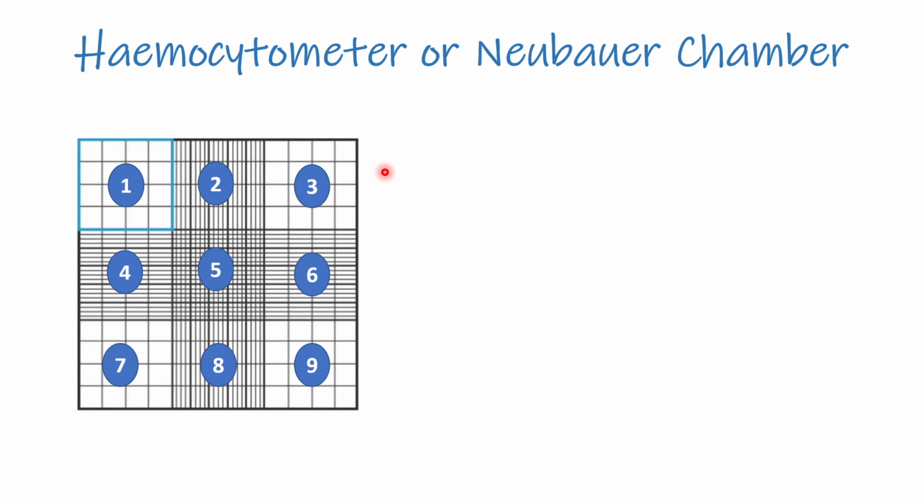Now this distinction is important actually to help us scientists to count samples when they have too many cells or not that many cells. Okay, and we will explain that later.